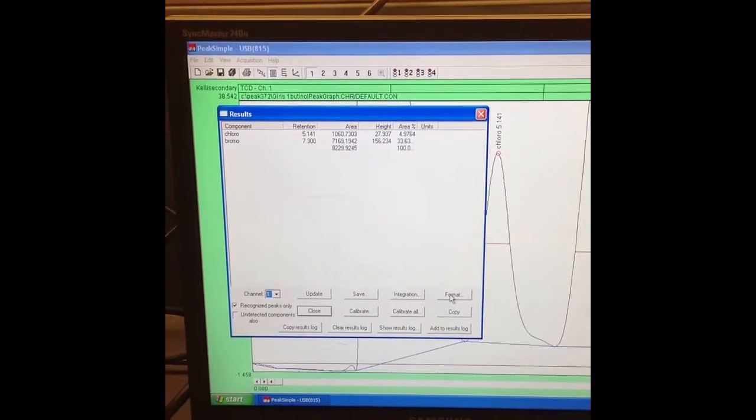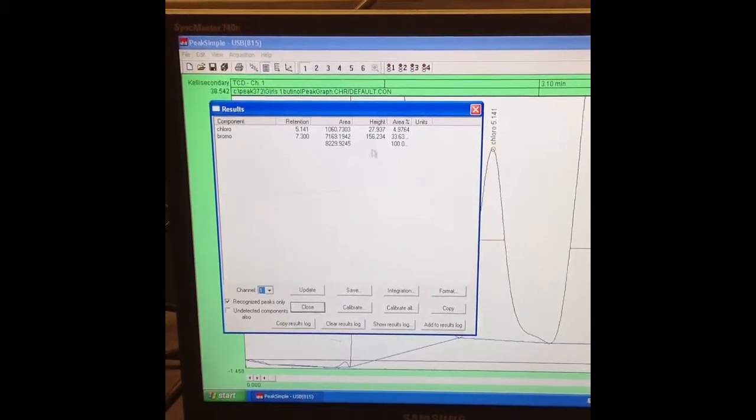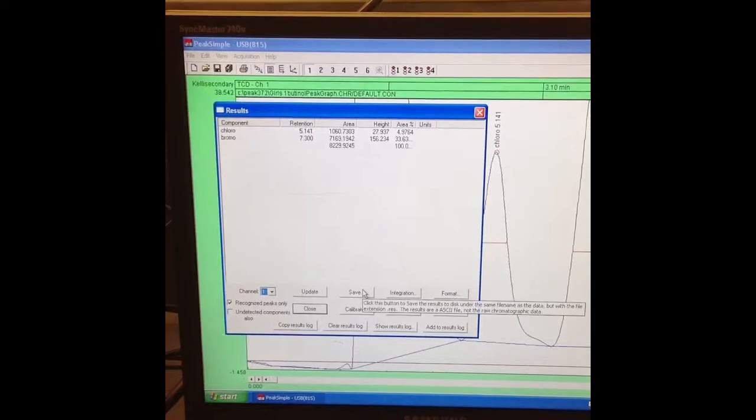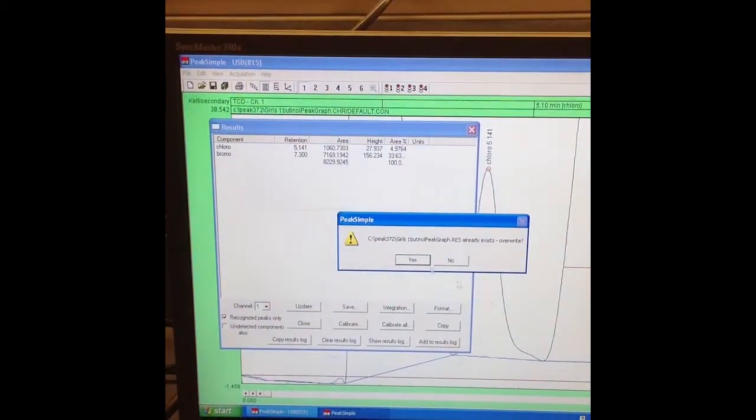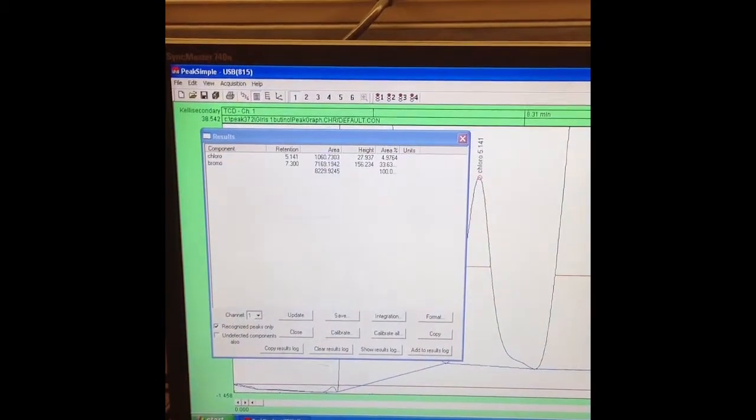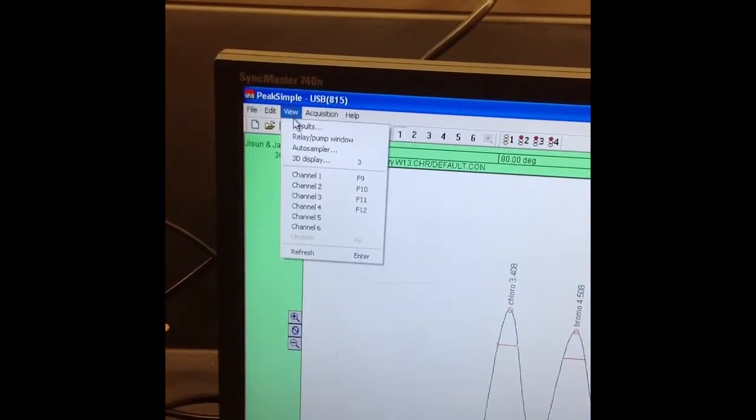If you want to change anything with this, you'll have to go to format and add additional components here. But we have everything we want, so we'll just go ahead and save it.